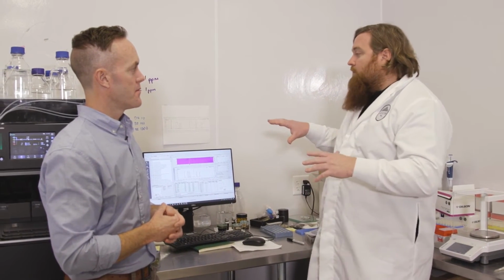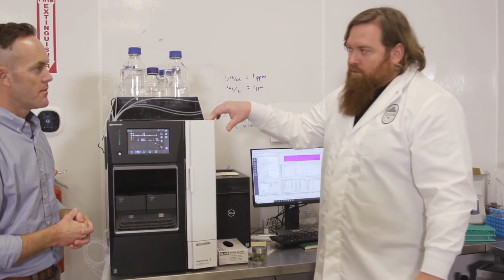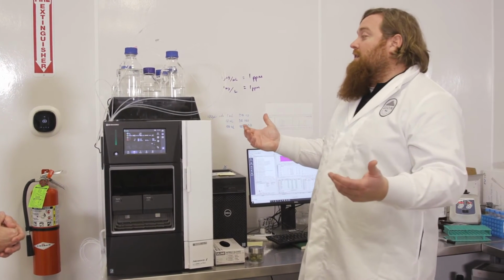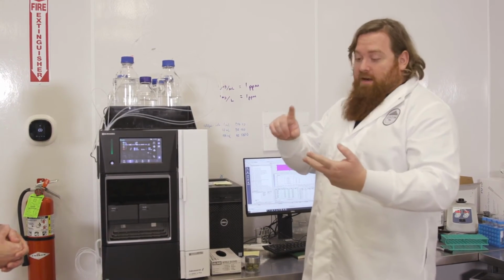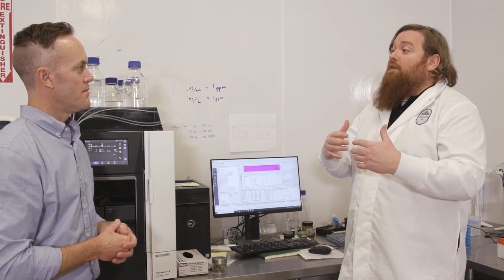Yes, we can. One of the things that we do is, this right here is called an HPLC. This is a high performance liquid chromatography machine. Basically we use this to determine our potencies. I want to know, for instance, the cannabinoid content. I want to know how much CBG I have, how much CBD. And if we are off significantly in our analysis, we can go back and add more of various individual cannabinoids to get where we want.